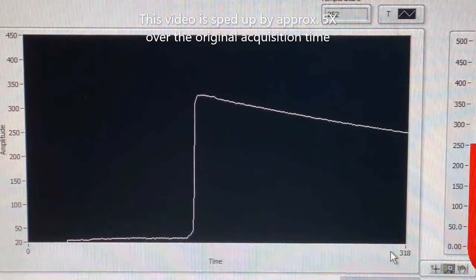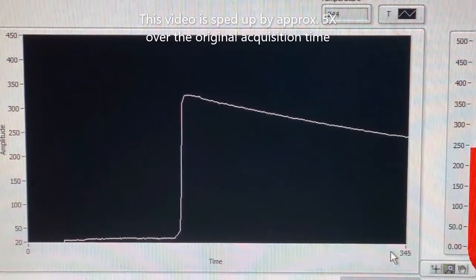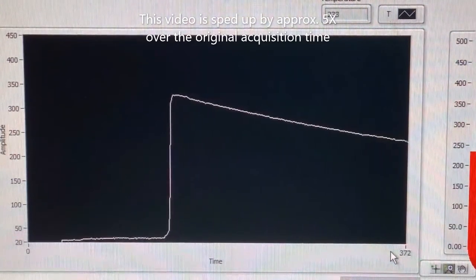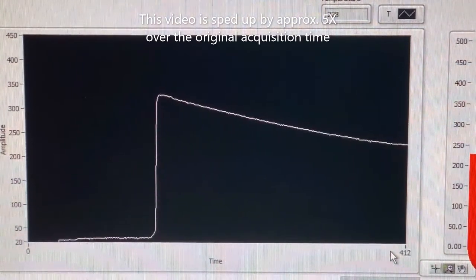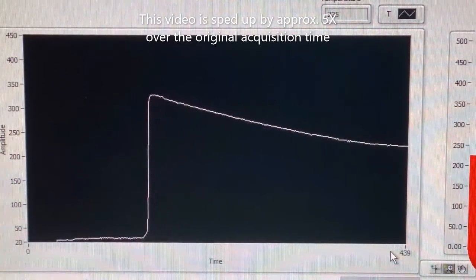It will become more horizontal in the diagram, but the change will not be to the extent we had for the pure lead solidification, because now we're passing through a two-phase region of liquid and solid. It'll be at a different slope than the cooling of the liquid, but it's not an isotherm.